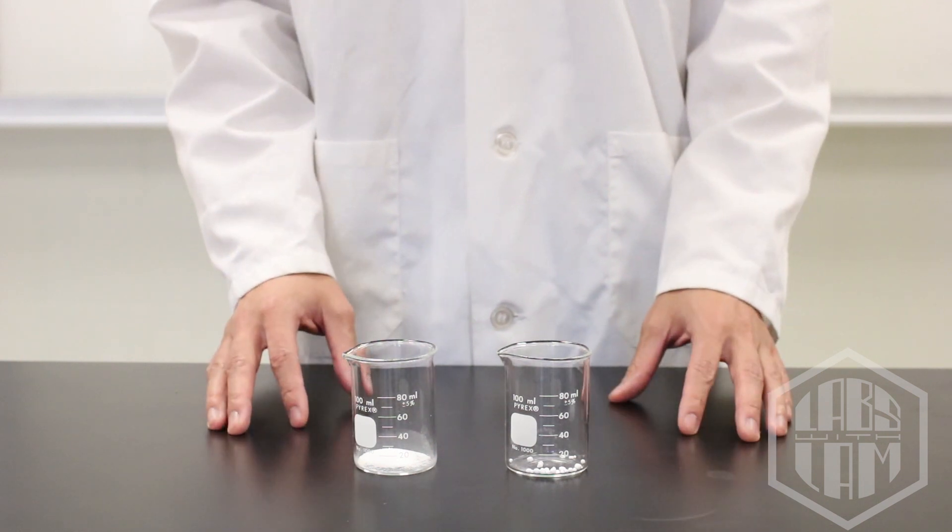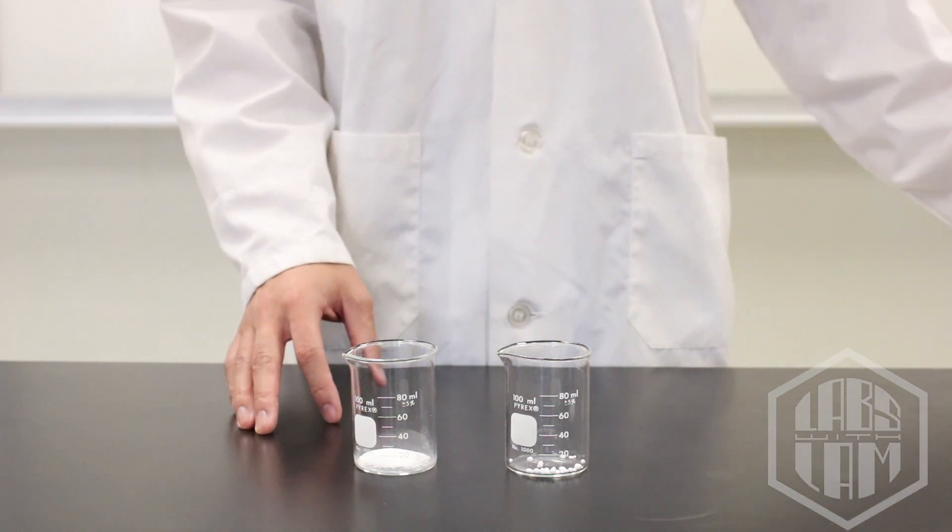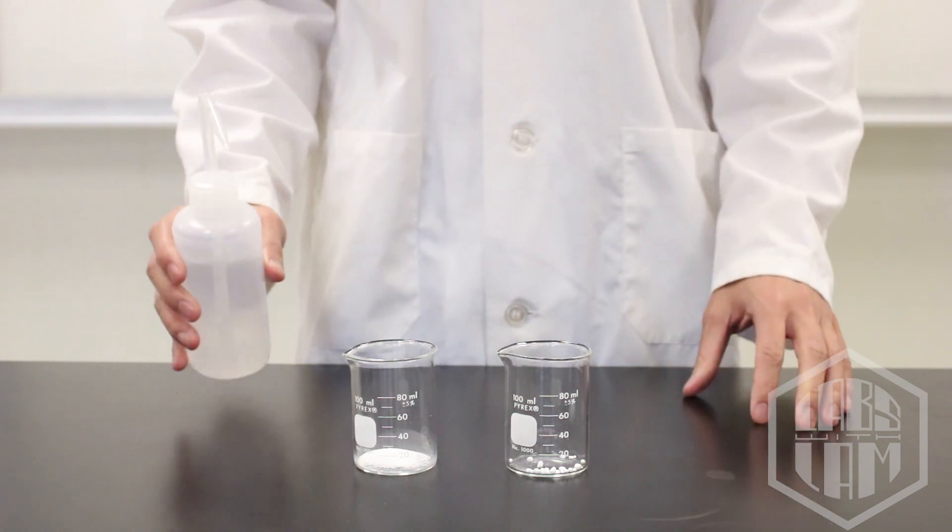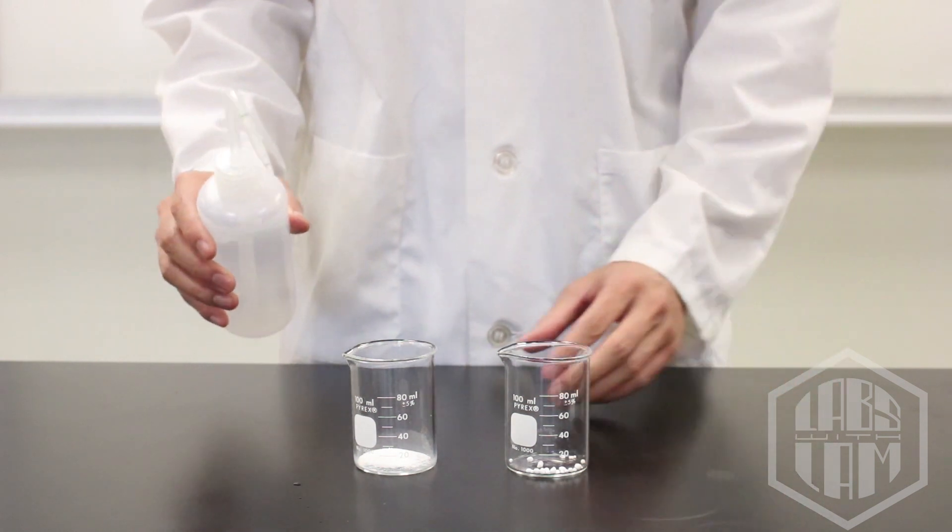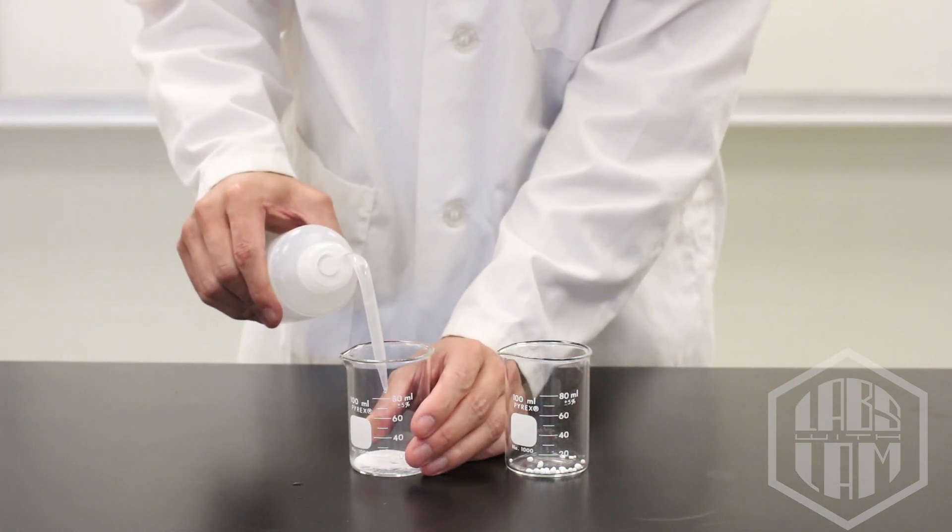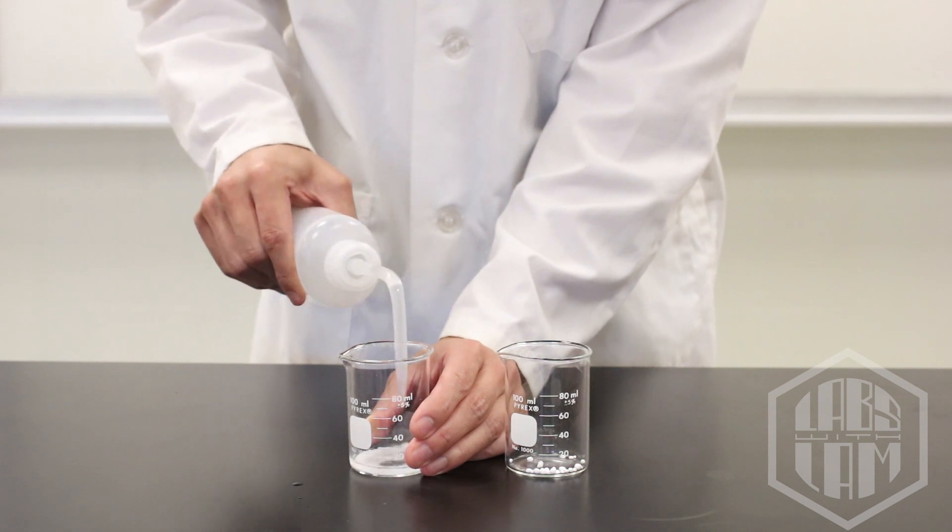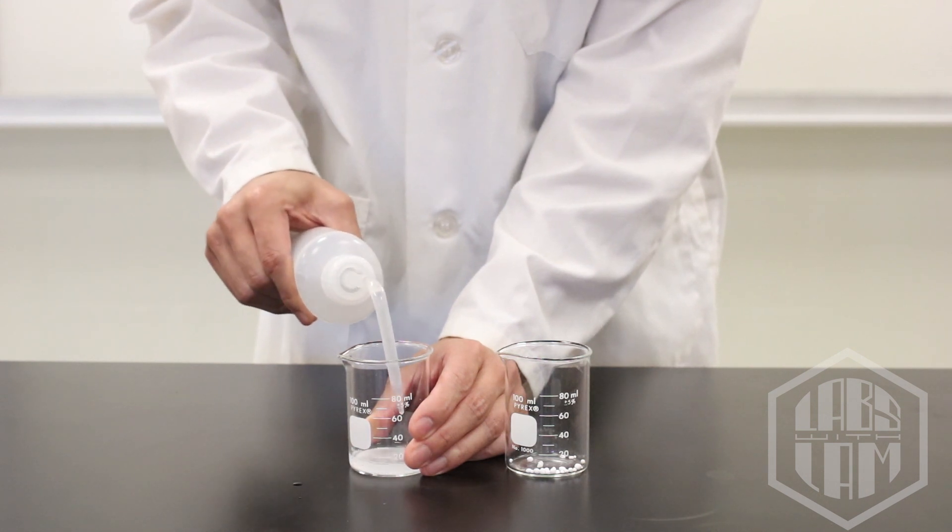Now that we have both of our chemicals measured out, we can dissolve them in water. I'm using a wash bottle to add water because it helps me keep the sodium carbonate from clumping together and it speeds up the dissolving process. Still, this usually takes a while, so I'll fast-forward through most of it.